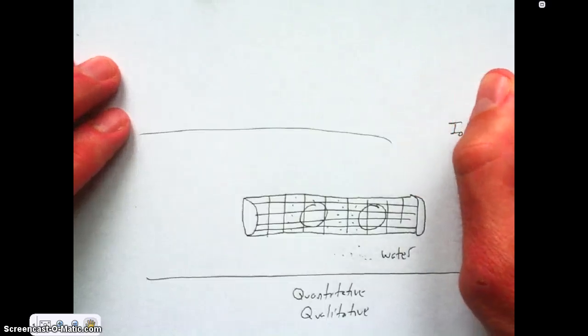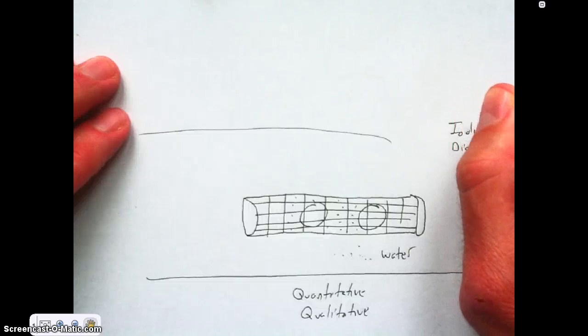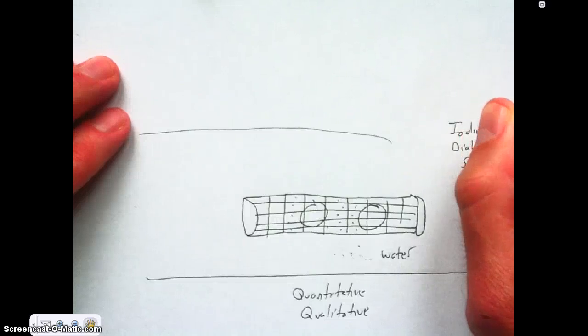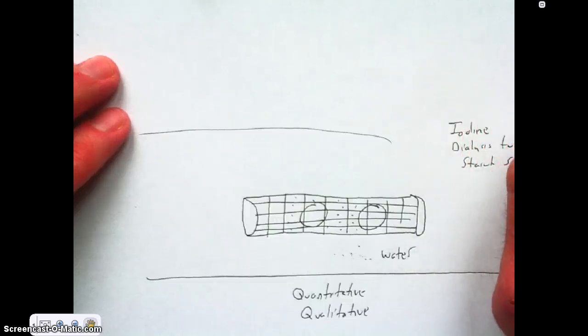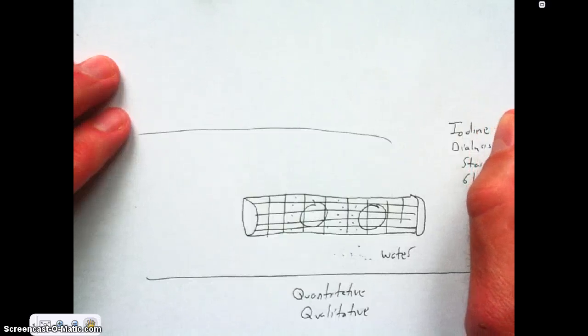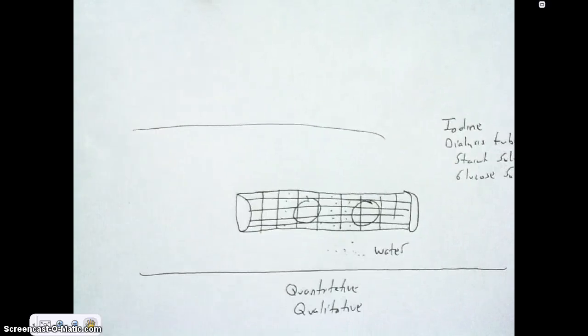I'm going to give you iodine. I'm going to give you dialysis tubing. I'm going to give you a starch solution. I'm going to give you a glucose solution. In this case, I told you it was going to be dextrose.